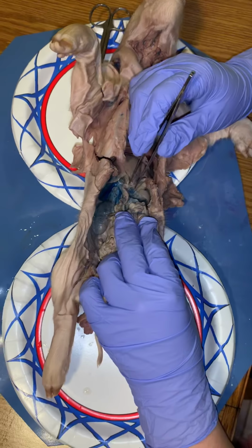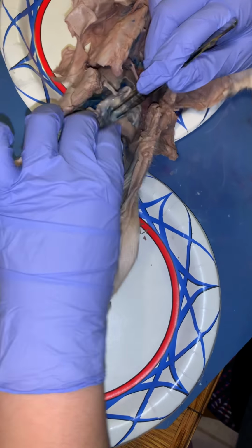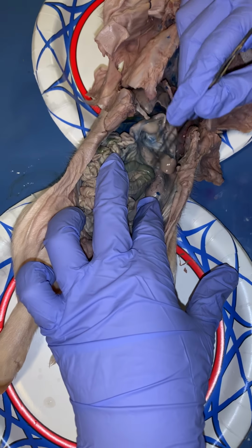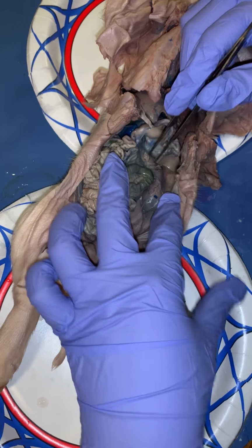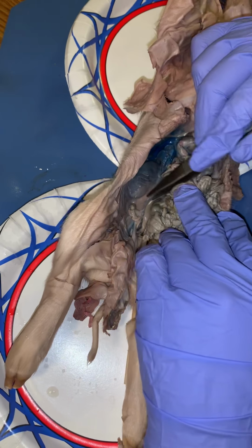And then next we have the pancreas. The pancreas I thought was a little difficult to find at first, but then I realized what I was looking at. And the pancreas is this organ right here. It kind of stretches behind the stomach. And I wasn't exactly sure what I was looking at first until I kind of removed a little bit of it. Okay, and that's all that I have found in the digestive system portion of this lab.